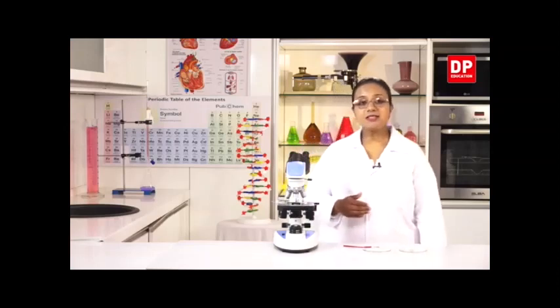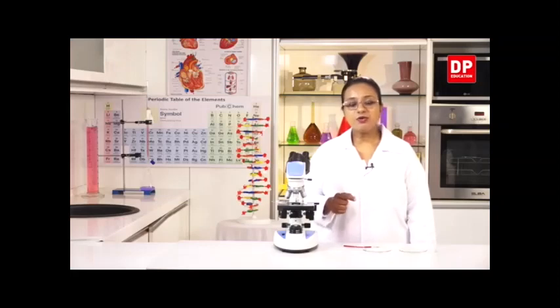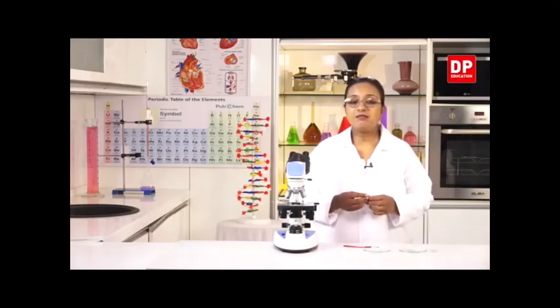And to prepare the sample or the specimen, we need to take cheek cells that you already know. With a very clean washed yogurt spoon, we scrape out a part of the cheek from inside. It's not that we really remove a huge part, just light scraping will give us some tissues. So that will be spread on a slide.